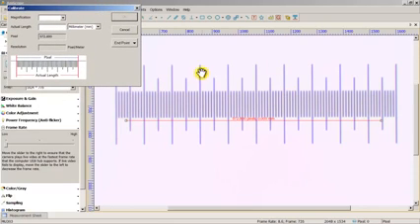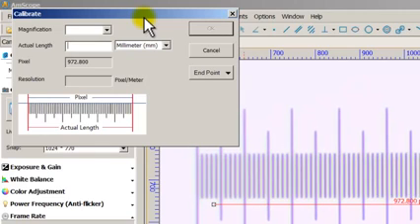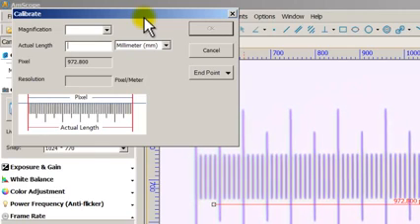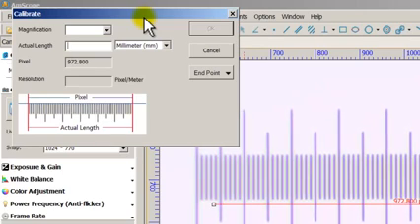So there's a calibrate box, and when you do that, you see this really long red line here. What this line is going to dictate is the actual length that you would put in this box, okay? So whatever I measure here is what I'm going to put on the actual length here. So right now on my microscope, I have the 4x objective set. I'm using a T490 series microscope. I'll include the link for that down below so you can check it out if you want to see the system specs on it and stuff.